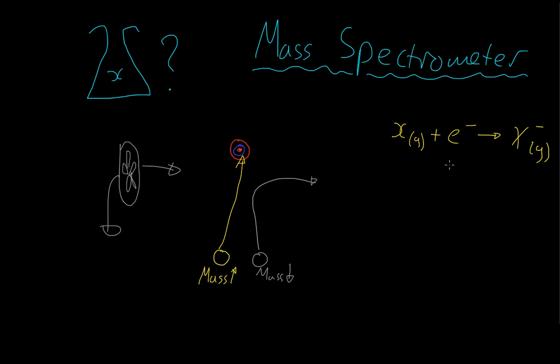And then, maybe with this, we could use a magnet to try and blow it out the way like we did with a ping pong ball. And with the added benefit that we're able to change how strong the magnet is if it's an electromagnet. So, if we ionize it, then we're going to need to throw it as we did with this ping pong ball and this tennis ball. So if we throw it down a tube with a bend in the middle and a magnet here, so this is my magnet, then this charged particle is going to get deflected by the magnet.